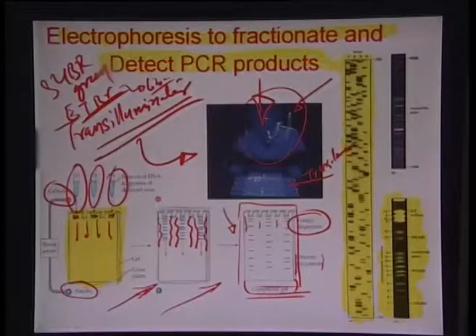Essentially, capillary electrophoresis has definitely been explored very often, where the gel material is injected and coated inside a very thin microcapillary which may be several microns thin. Although the resistance in that case increases hugely, because of a higher surface area to volume ratio there is greater heat transfer, and melting of the gel material or the separation matrix doesn't take place that often, or it takes a higher amount of voltage to cause enough heat for the gel to melt.